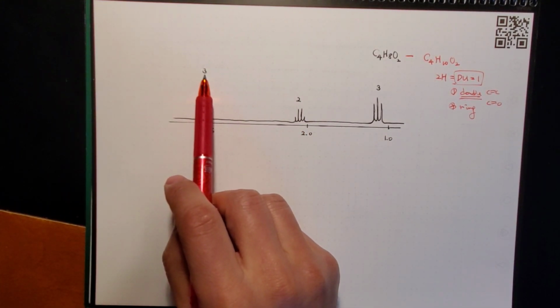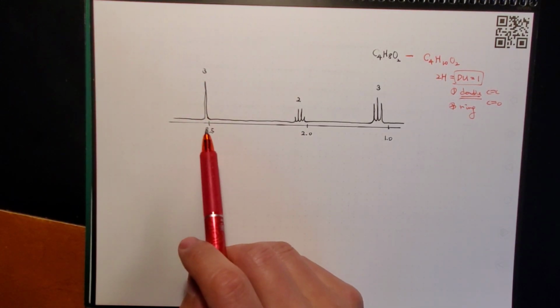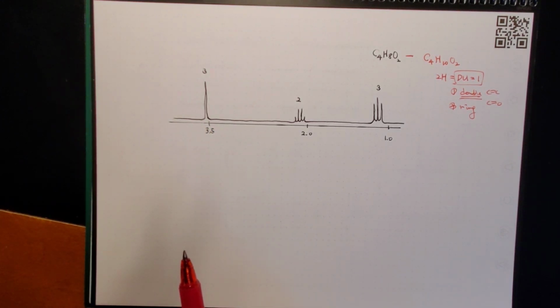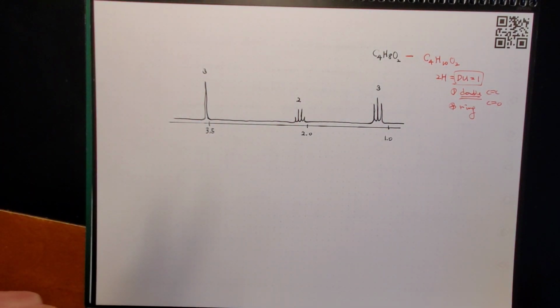These 3 hydrogens showing 1 signal, right? And it is around 3.5. What does that tell you? You can make up a nice table, but let's do that when the problem becomes complex. On the test, if you're taking the MCAT or GRE, most of the time you don't have that amount of time for organizing data that way.